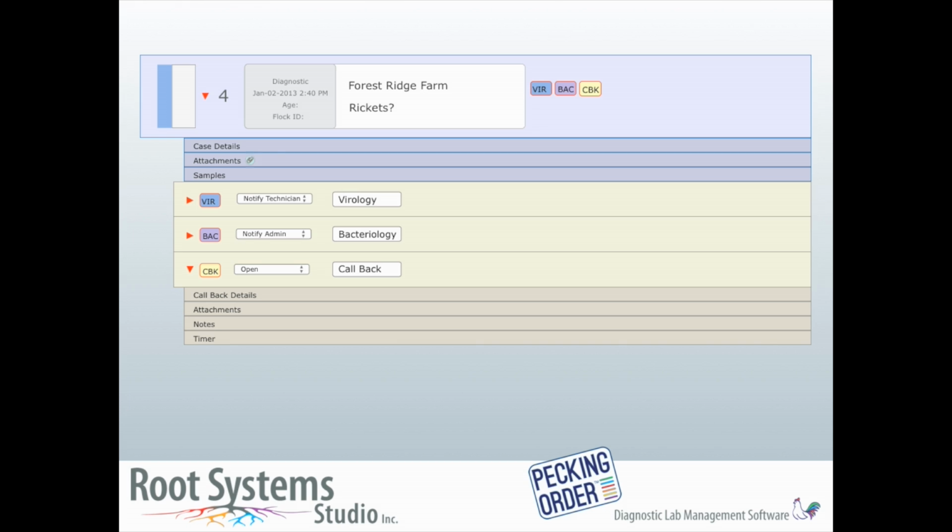Markers let us know what samples and attachments are attached to cases and services. You can roll over them to see specific information or use them as links to access the information. Markers bubble up from below. In other words, if a person adds an attachment to a service, a marker will appear on the service when the list is open, or bubble up to the top level if the list is closed. The most common types of markers are for samples and attachments.